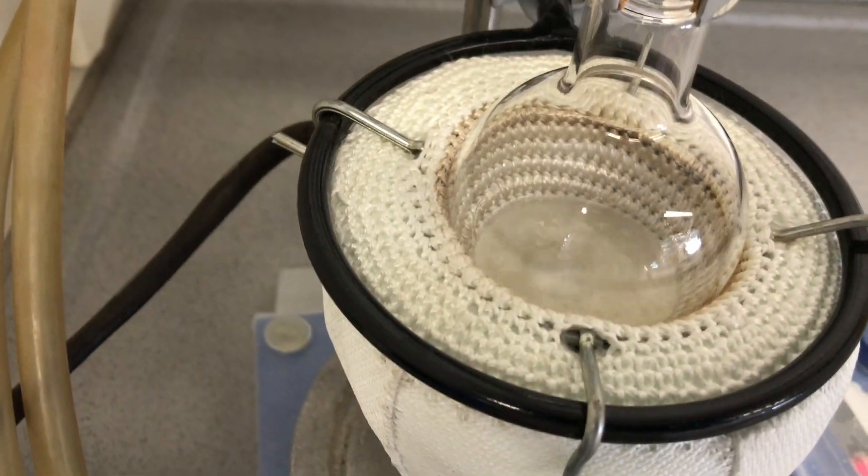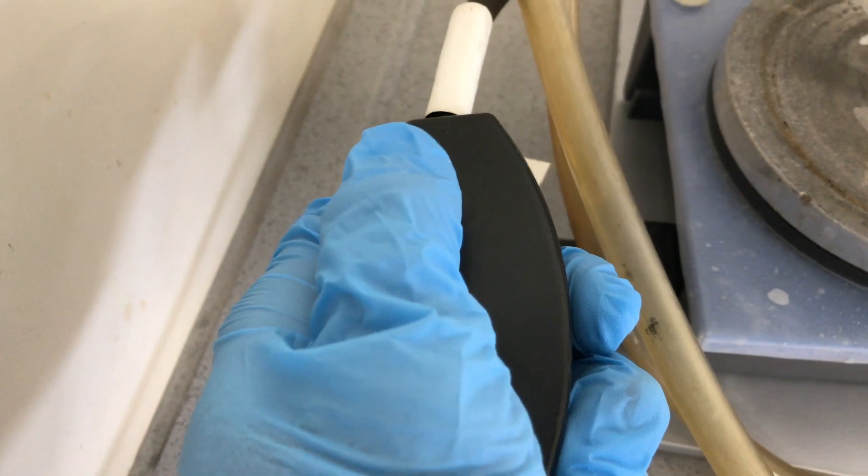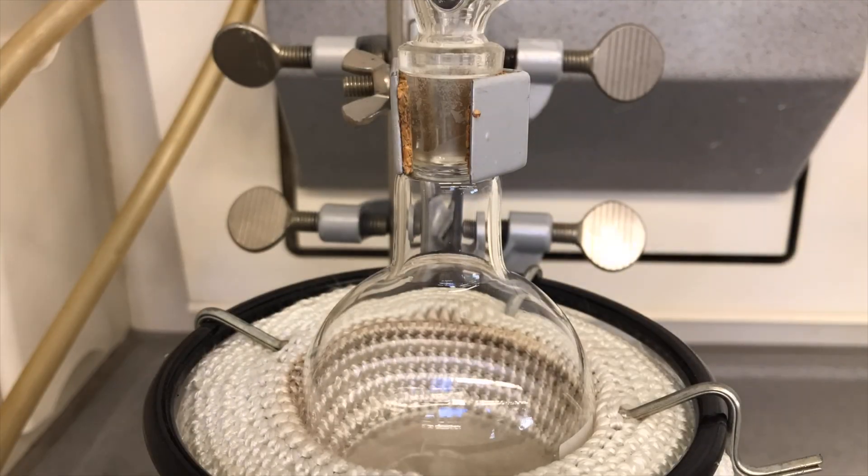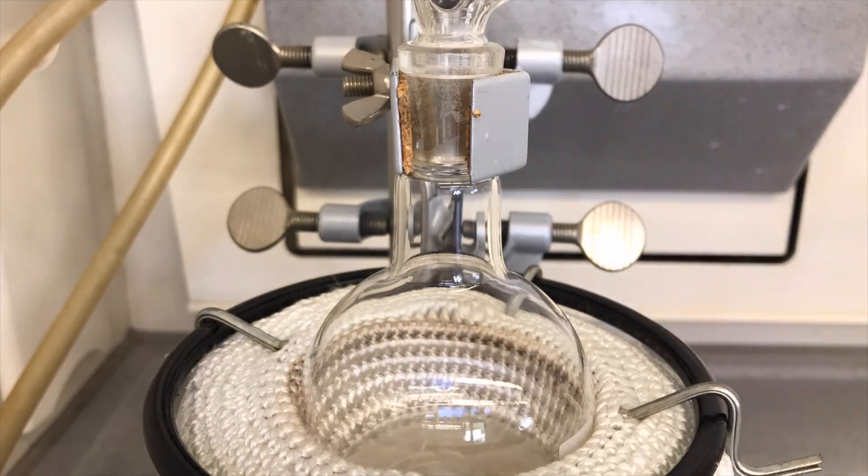The dehydration reaction of chloral hydrate using sulfuric acid should already proceed at room temperature. But we want a pure product. So how do we get one? We need to distill off the chloral. Chloral has a boiling point of about 97 degrees Celsius, which is lower than water.